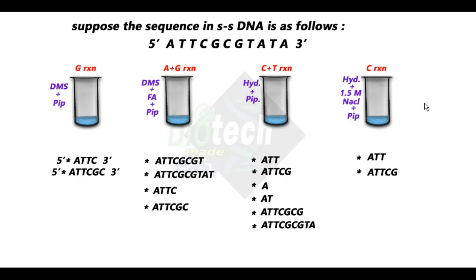And then we'll see how we'll do the interpretation. And then ultimately you will be able to get the same sequence, except for the first base. Right from the second base we'll get the sequence.